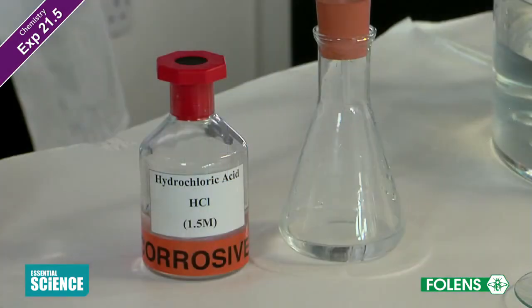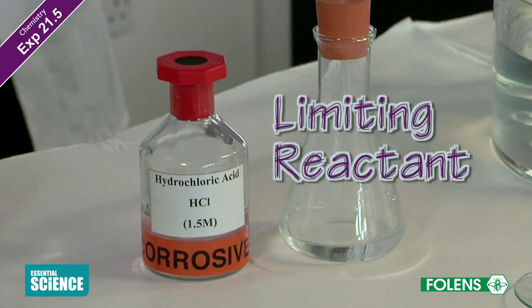Note that the reaction stops when all the magnesium metal has been used up. The magnesium is said to be the limiting reactant. This means that it determines or limits the volume of hydrogen formed.